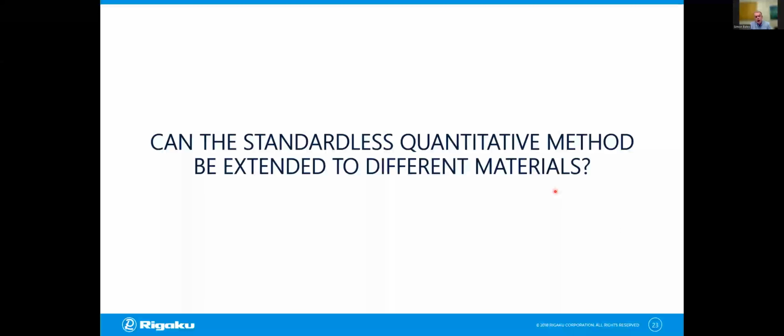So the question is, well, we've demonstrated components. We understand what they are. We can measure them, or you can actually calculate them if you have single crystal structures. You can extract them from complex mixtures. My preferred approach is to always extract components from real mixtures, so tablets, intermediates, real products that you're going to be working with. I really don't like doing it from measured pure forms because they introduce other errors like additional preferred orientation.